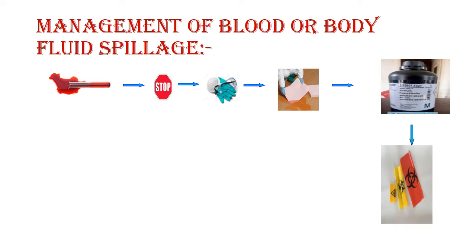Dispose of the soaked towels, gloves, mask, and apron in appropriate bags as per waste segregation policy, then wash and dry hands. If the spillage involved a blood sample whose test has not yet been done, record the incident in a blood spillage register, inform the patient, apologize for the event, and collect a fresh sample if required. These are the steps for management of blood or body fluid spillage at a laboratory workstation.